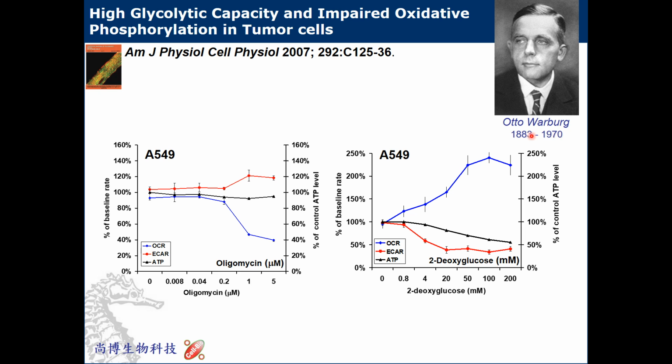From a normal cell, you transfer to prefer glycolysis more and your mitochondrial function is dysfunctional. That is the transformation from normal cell to cancer cell. We call it the Warburg effect. Then we can show or prove it with the Seahorse analyzer easily by this experiment design.